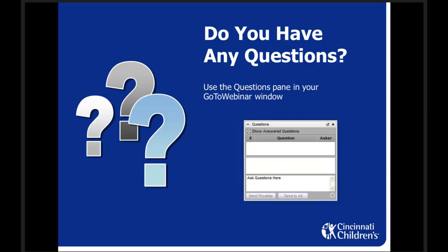But shortly after we got this data set, we started using build 37. And so we recalled this data, but for the talk I did not actually have the build 37 BAM files, and so that's why I was using that cheat sheet, because those candidates had already been transposed back to build 36, so I could use GenomeBrowse to find those sites very quickly.